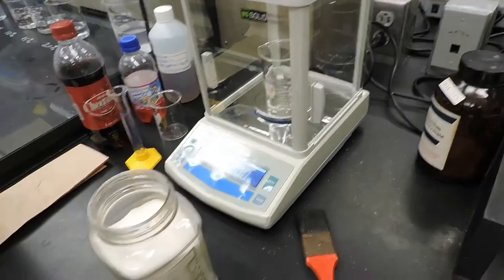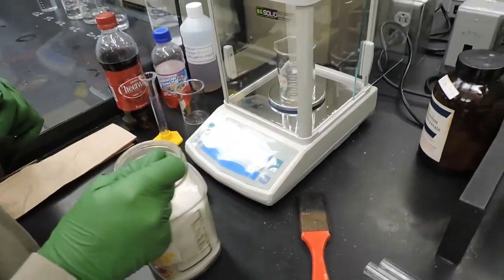So how we do this is we have a beaker and we're going to weigh out approximately 5 grams of sugar for the 5% sugar solution.